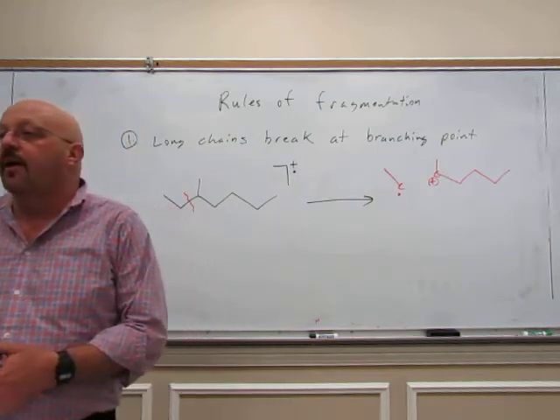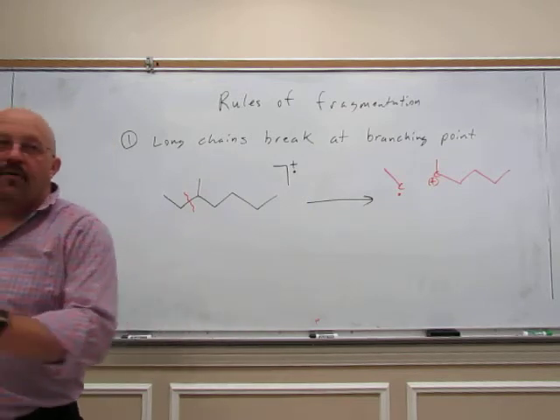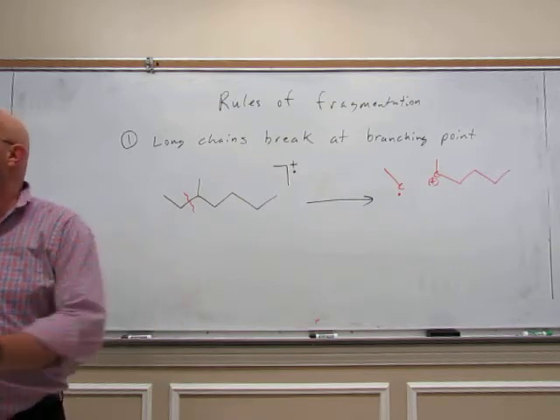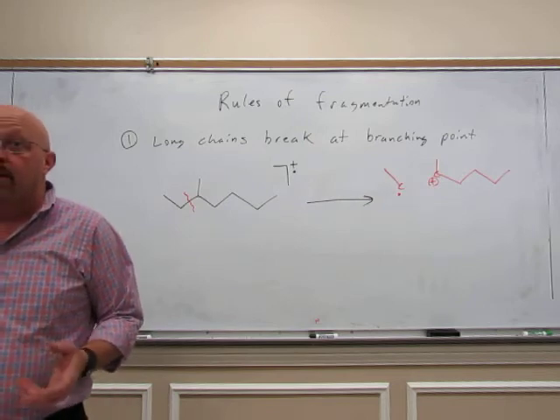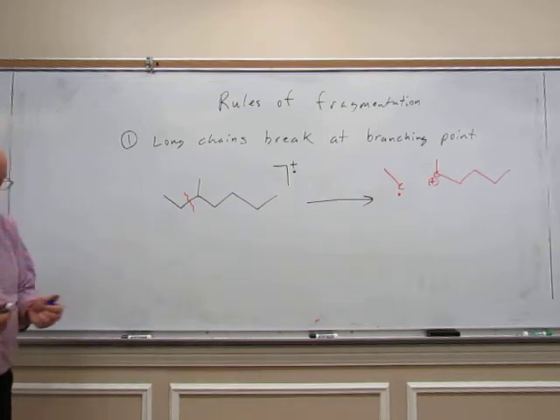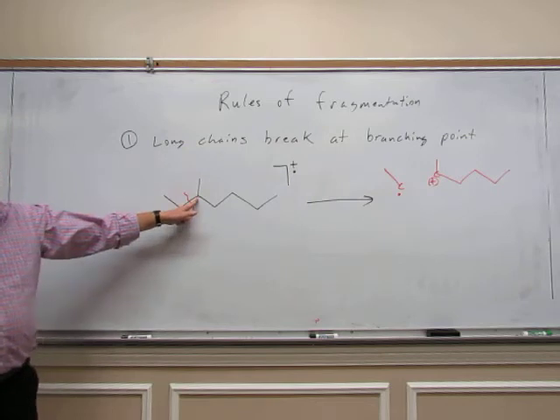By the way, before I forget it, in our mass spectrometer, things are moving through so fast that normally the molecules do not have time to rearrange. So we don't do cation rearrangement in the mass spectrometer. We're shooting them through in just milliseconds or microseconds, very quickly, so they don't have time to normally rearrange. So the bond breaks, there's the cation, and it just stays right there.